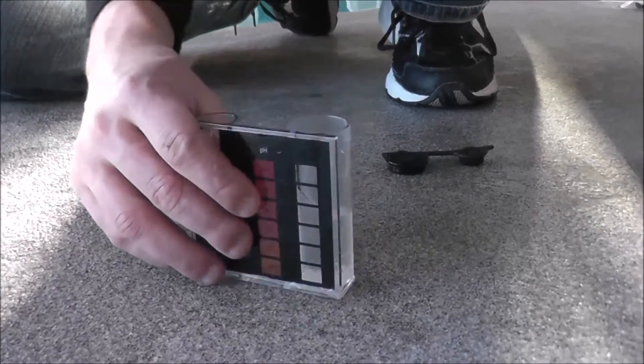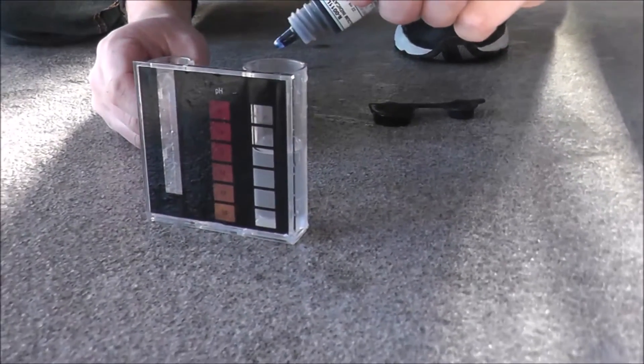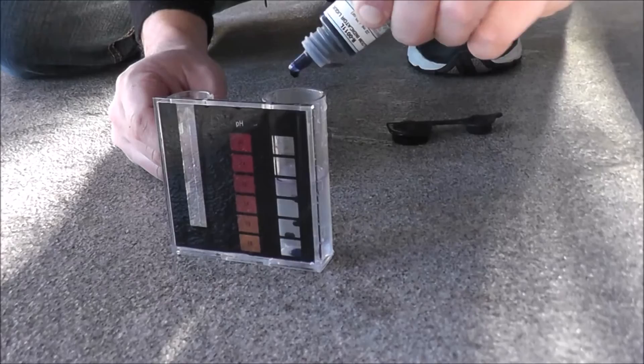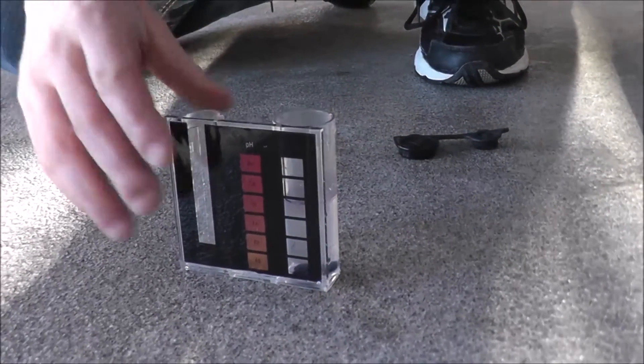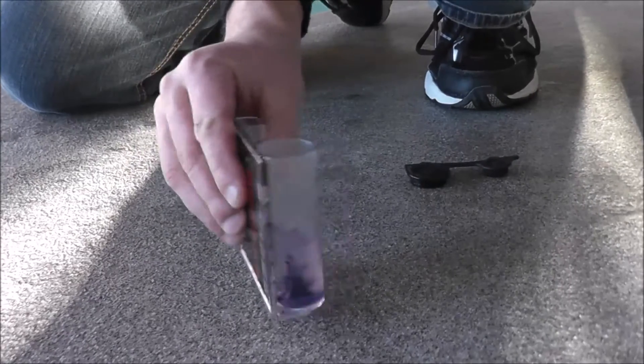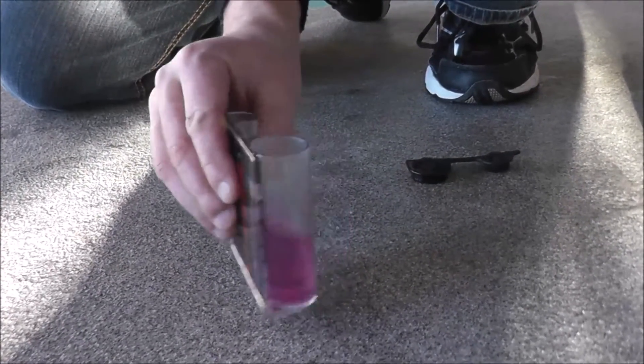The second reagent is blue in color, but it actually turns the water red. You add 5 drops — 1, 2, 3, 4, 5 — and you'll want to mix this one thoroughly. You can see it's starting to turn color — now it's starting to get red.